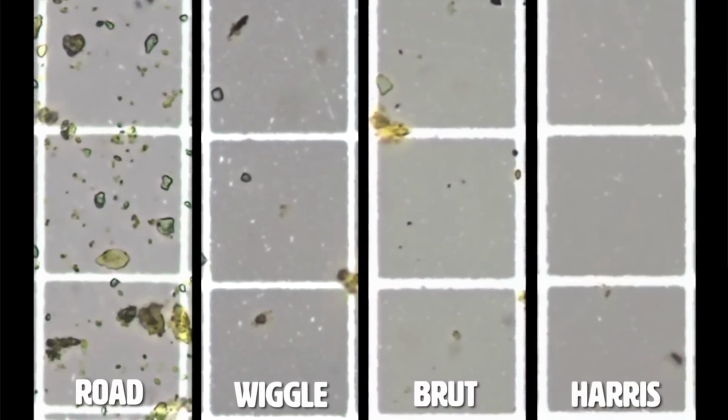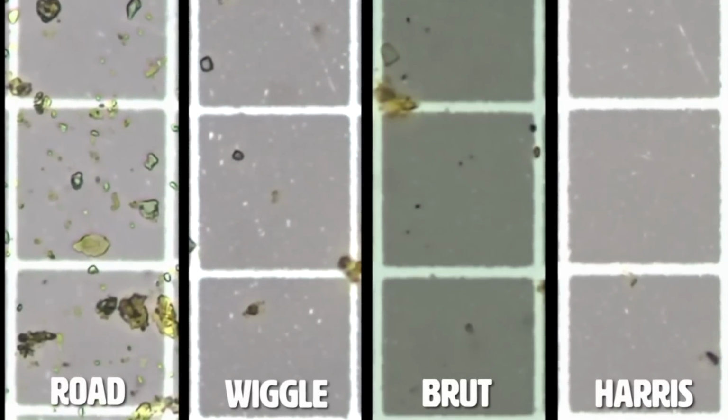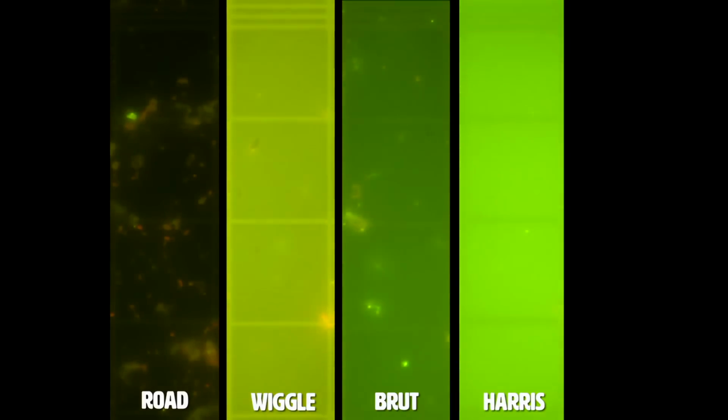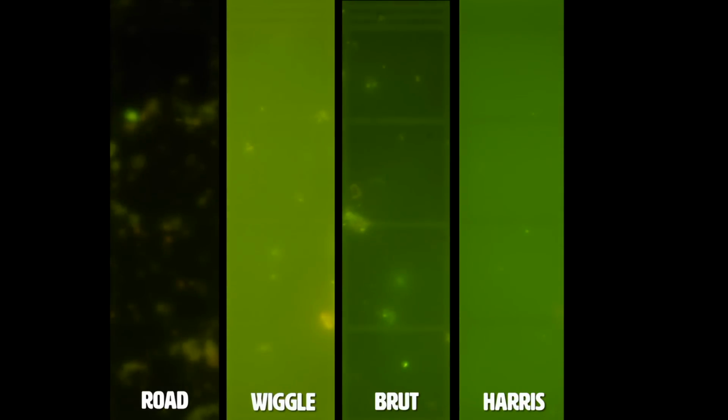You can look at it and you can see how much is in one, how much the diversity in one, the organic matter in one compared to all the others. You can also see a range of expression. Check out this. Using epifluorescence in acridine orange, we essentially have a dye that glows when it's not absorbed over the whole slide, right? But when it's absorbed by life, it's held inside the life and only they glow. And so it makes the whole slide dark. So the more life, the darker the slide. The less life, the lighter the slide, right? And there's nuance, right? You can see the differences in color.